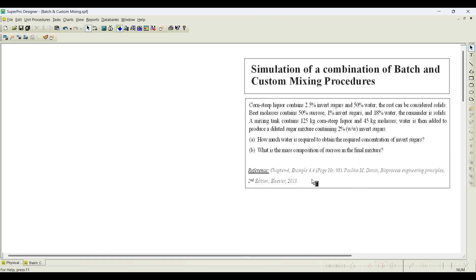I have taken this example problem from the book 'Bioprocess Engineering Principles' authored by Pauline M. Duran — Chapter 4, Example 4.4, available on page 98. The problem statement is as follows: Corn-steep liquor contains 2.5% invert sugars, 50% water, and the rest are solids. Beet molasses contains 50% sucrose, 1% invert sugar, and 18% water; the remainder is solids. A mixing tank contains 125 kg of corn-steep liquor and 45 kg of molasses. Water is then added to produce a dilute sugar mixture containing 2% (w/w) invert sugars. We need to find how much water is required and the mass composition of sucrose in the final mixture.